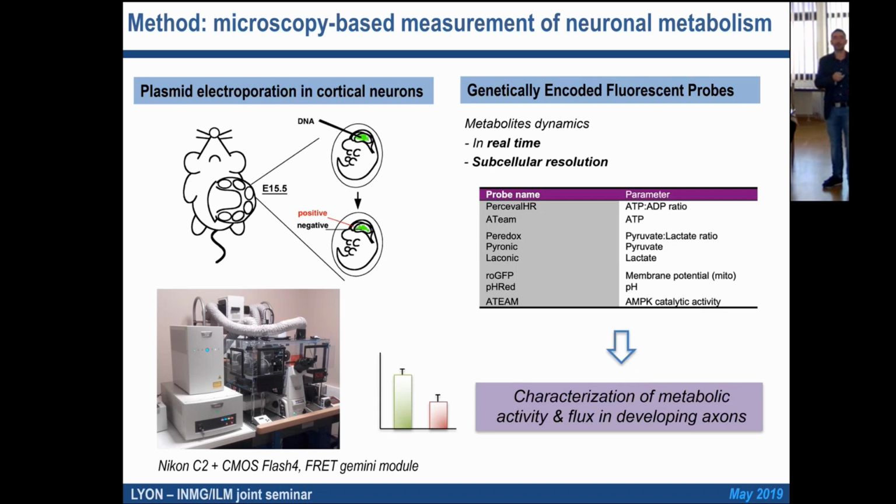And the last thing, because you are doing live experiments, you need an inverted microscope. You need the light to come from below and not from above, because you cannot just flip the box. The cells will be in a medium that is adapted to imaging, so a medium that does not contain phenol red and other stuff.